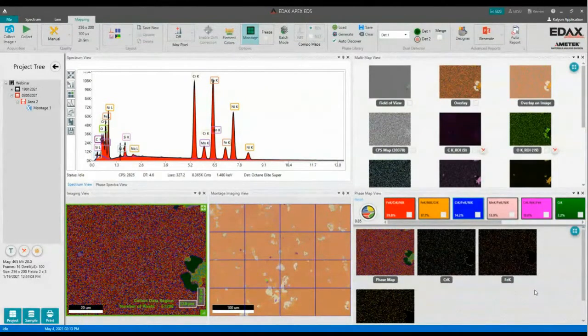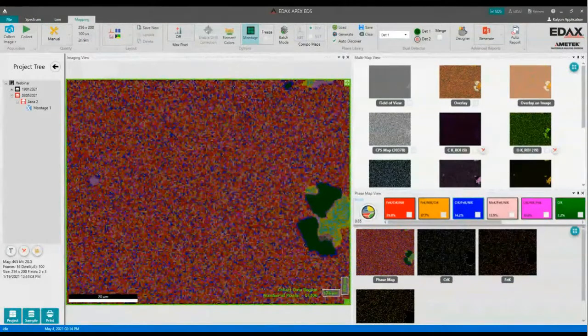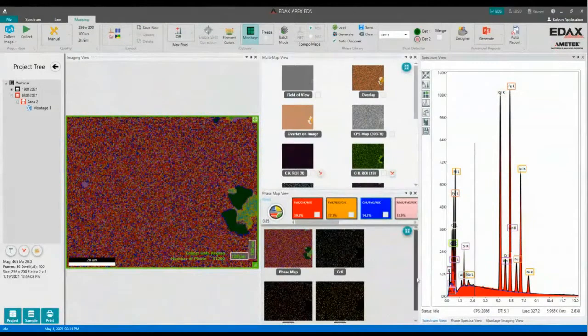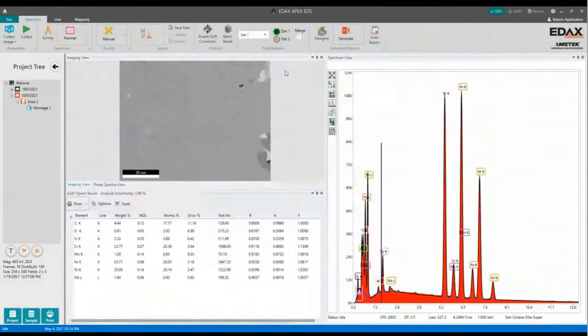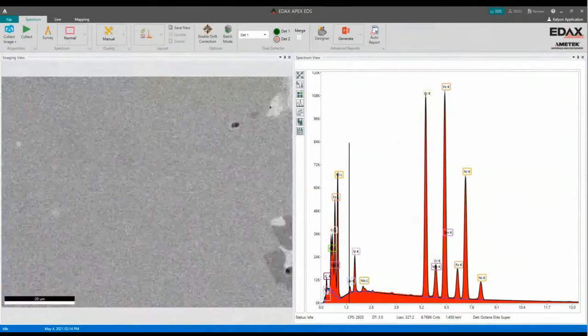You can freely choose a window and set it to another area, so it is individual and customized. So we can also go over, like that, and see that we have some templates for the user interface. So you can select this template, or you can do it on your own and optimize and customize your user interface.